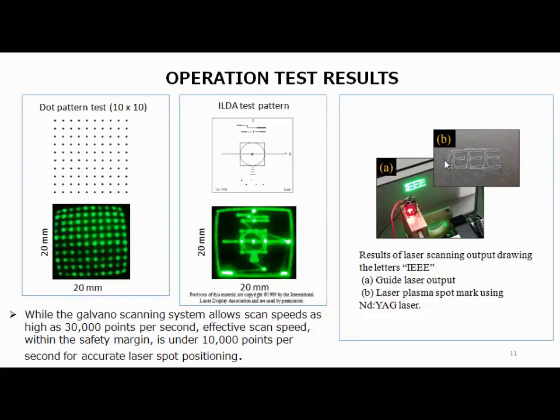This is an operation test of the laser irradiation. The green laser is a DPSS laser used as a guide laser. The galvanometer scanning system allows scan speeds as high as 30,000 points per second; however, the effective scan speed within the safety margin is under 10,000 points per second for accurate laser spot positioning. The left side shows a dot pattern test, and the middle one is the ILDA test pattern. The scratch lines are because the blanking signal was not set, but if a pulsed operating laser is used, these scratches can be ignored.